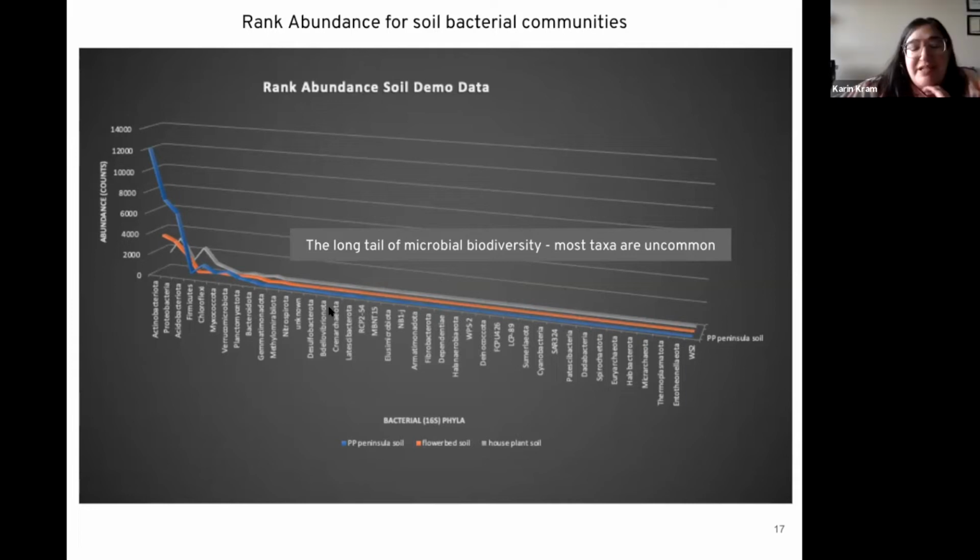I had a quick question. You had mentioned asking students to think about whether or not the different alpha diversities might be significantly different from each other. I was wondering if there were any statistical tests in this software somewhere to allow them to actually test it, or if there's an easy test that students can do.